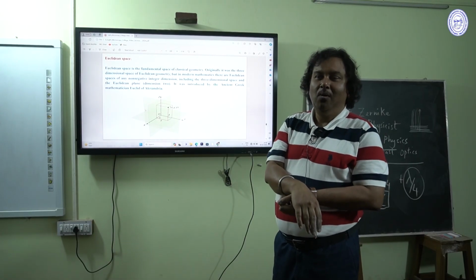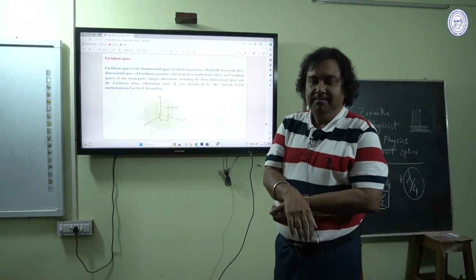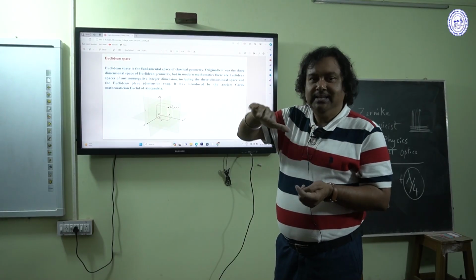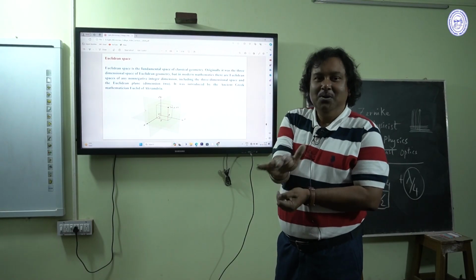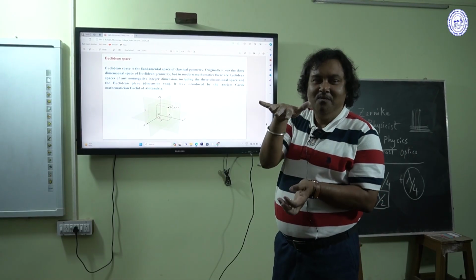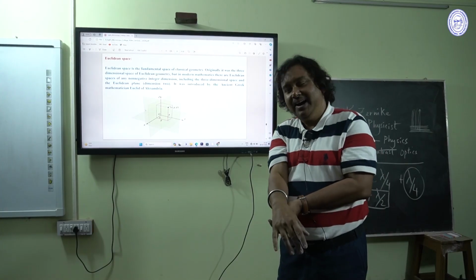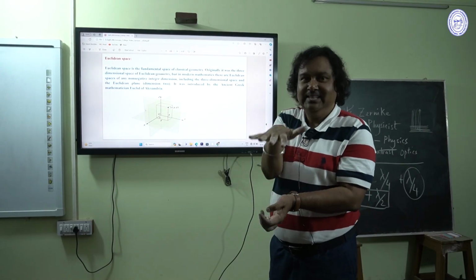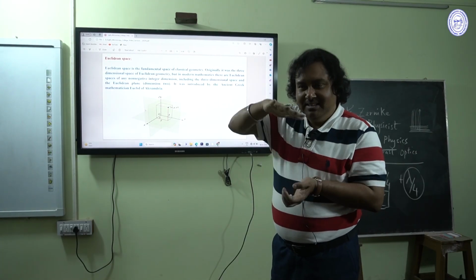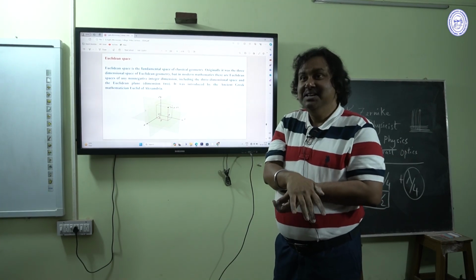Which book will contain more information? You will easily say that, sir, the book that has 1000 pages will contain more information. Please try to imagine one page is one scan. The 300-page book has 300 scans. The book that has 1000 pages has 1000 scans.